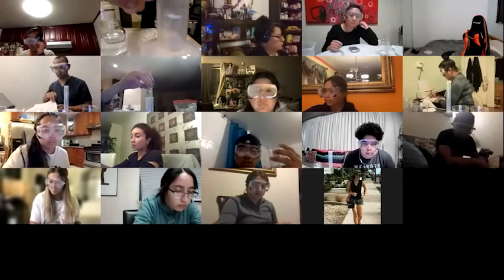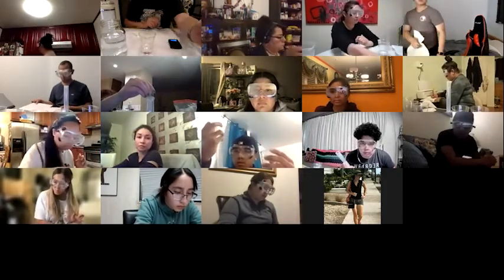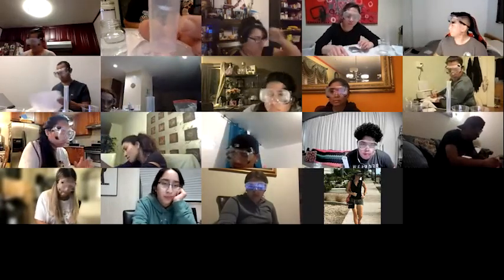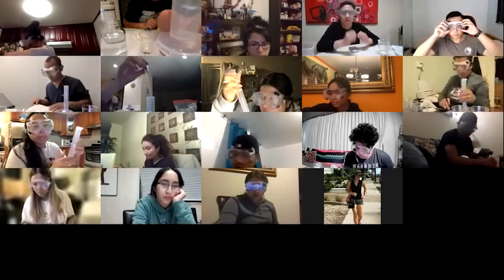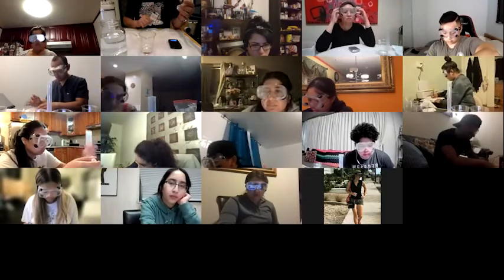So you can see the 10 mark is here, so the 5 is halfway up. And you can probably see this better on your own. But the 5 mL mark is a little bit longer, a little bit wider than the rest. It goes 1, 2, 3, 4, and then 5 is a little bit wider.